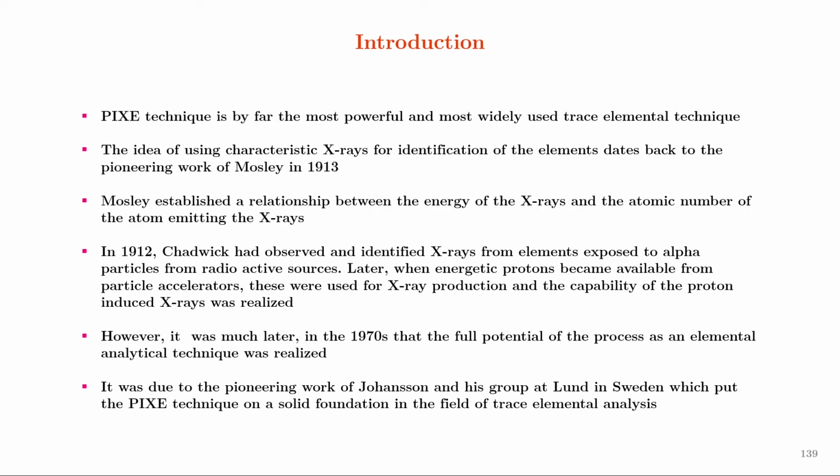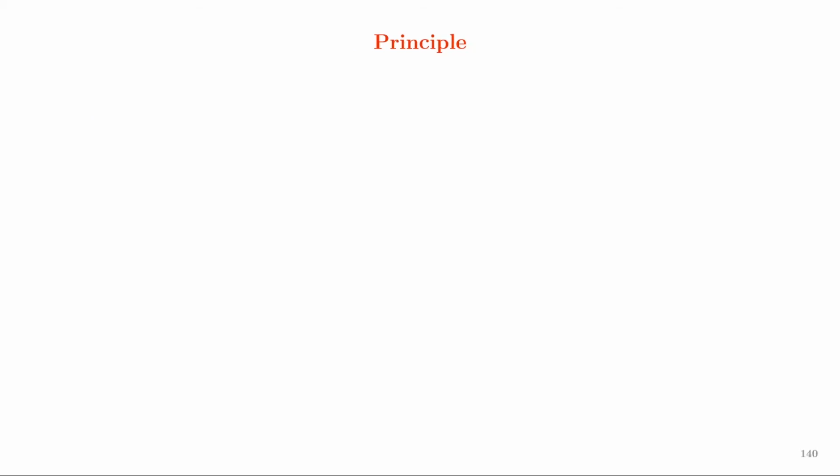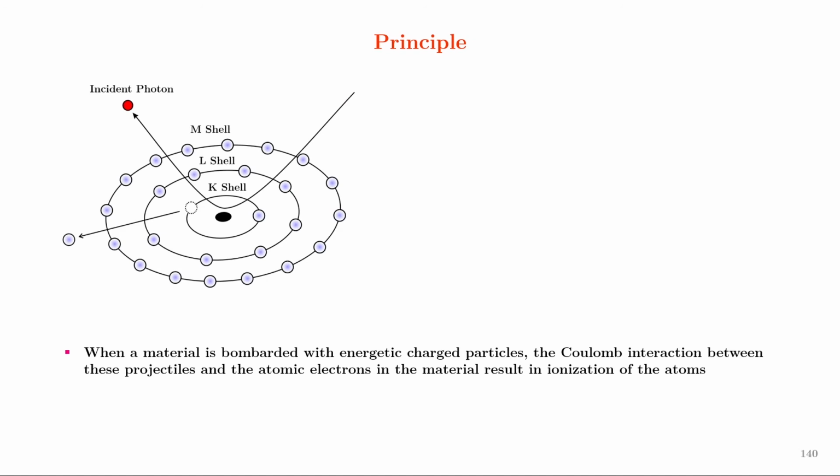It was due to the pioneering work of Johansson and his group at Lund in Sweden, which put the PIXE technique on a solid foundation in the field of trace elemental analysis. Principle: when a material is bombarded with energetic charged particles, the Coulomb interaction between these projectiles and the atomic electrons in the material results in ionization of the atoms.